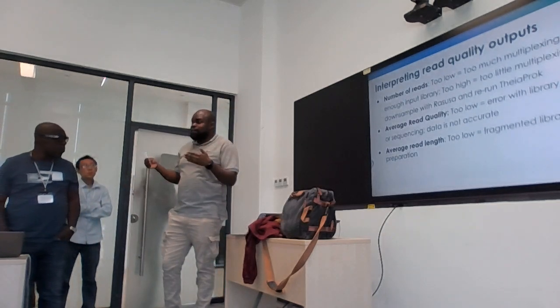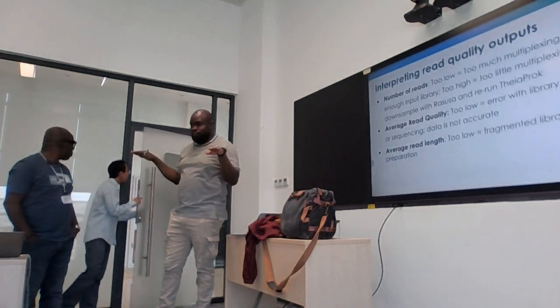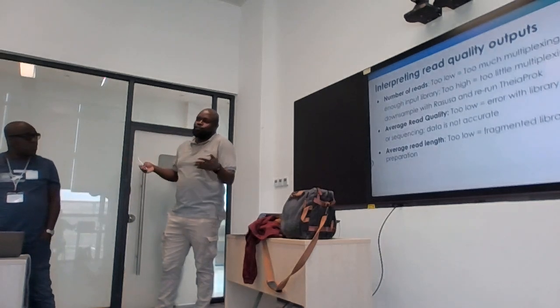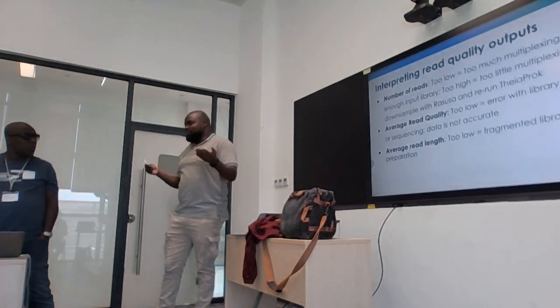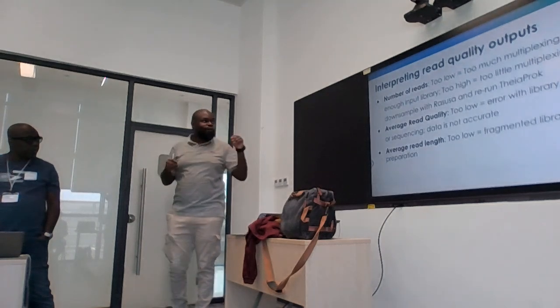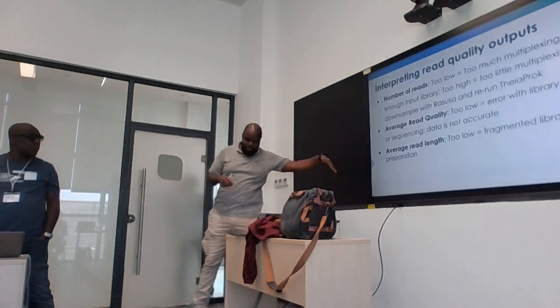But sometimes, even if you have the same concentration, there's something beyond you, especially if you're working with different pathogens. Some pathogens will usually just be sequenced more or faster than other samples. So again, this is the reason why we go back to looking at this quality, so that it can inform our lab process.